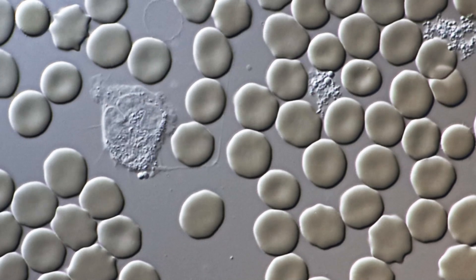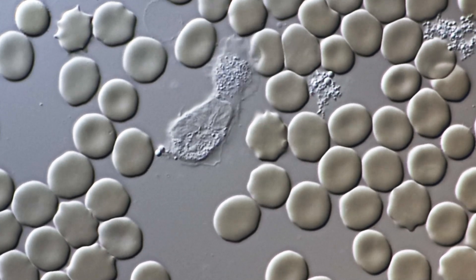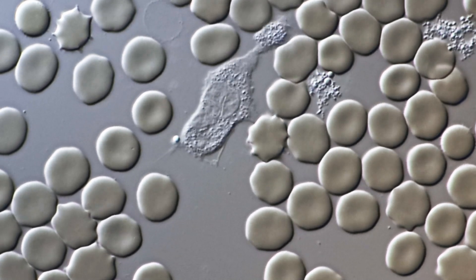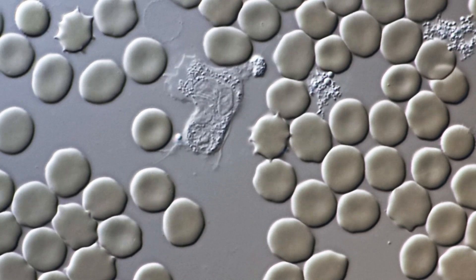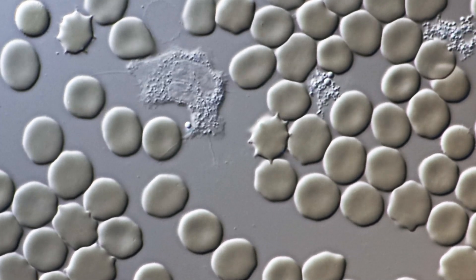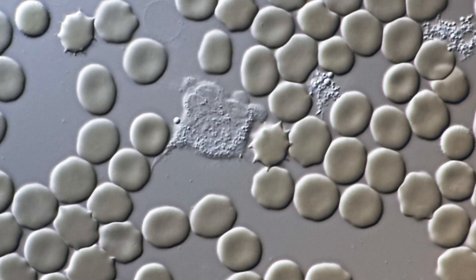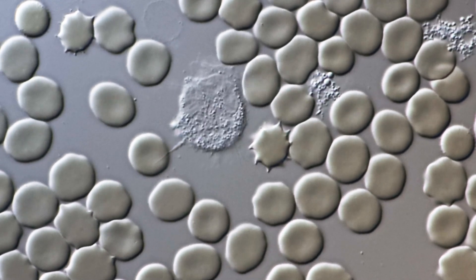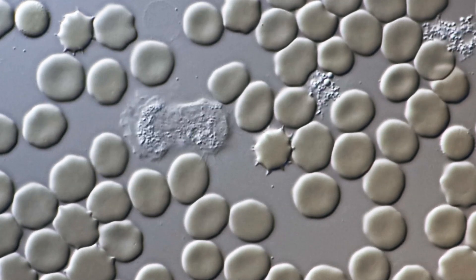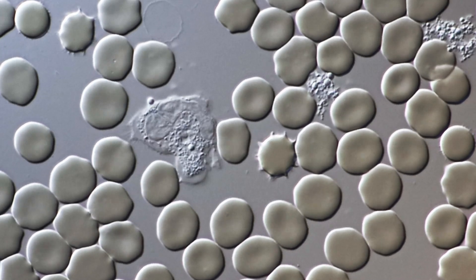Many people would like to know the magnification. I would say you need at least around 400 times — pretty much any compound microscope these days is able to do that. A stable camera system is the most important thing, or you can try to mount a mobile phone in front of the eyepiece. I would simply recommend taking a video for about half an hour, then in video editing software speed it up 10 to 20 times, and then maybe you'll be able to detect some of those white blood cells moving around.